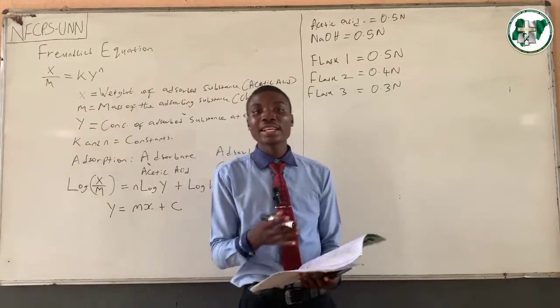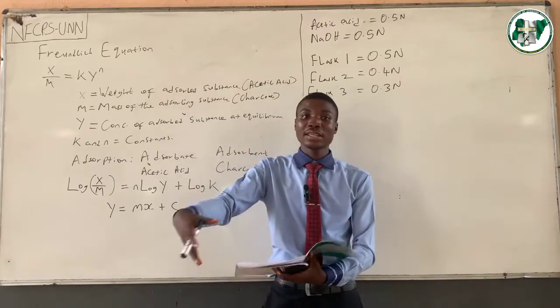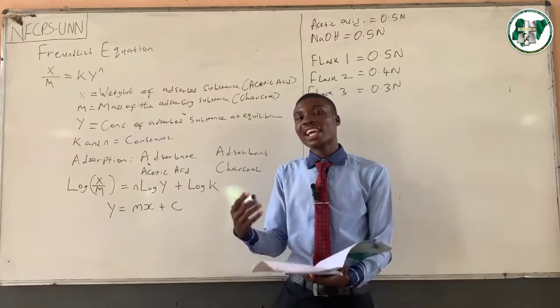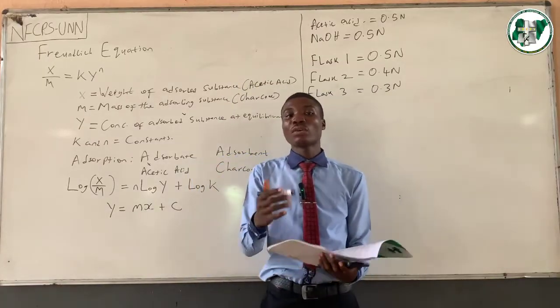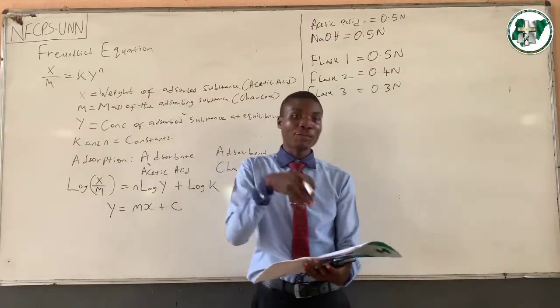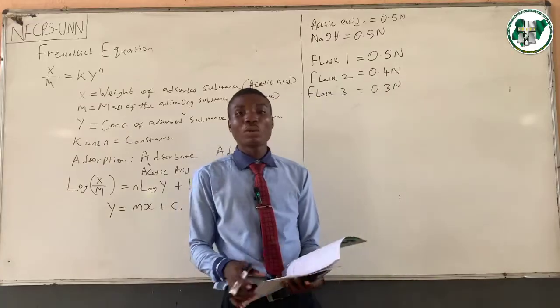Now, phenolphthalein is already in the acetic acid solution, that is, the filtrate you have is acetic acid. Phenolphthalein in acid is colorless, but at the end point, you have it as pink. So the implication is that while you are titrating, you are watching out for the color change from colorless to pink. So that's exactly what the experiment is.